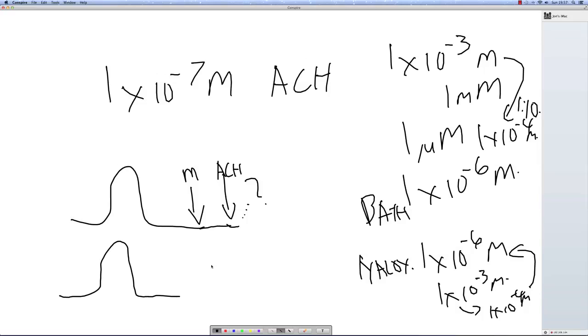After you've done the control response, you're going to do the 3-minute cycle again, except this time you're going to add the naloxone. You're going to wait a minute, then you're going to add the ACH, and then you're going to see what the effect is. After you've done that, you do another ACH response on its own in 2 minutes, just to make sure that everything has returned to normal, before moving on to part 5.